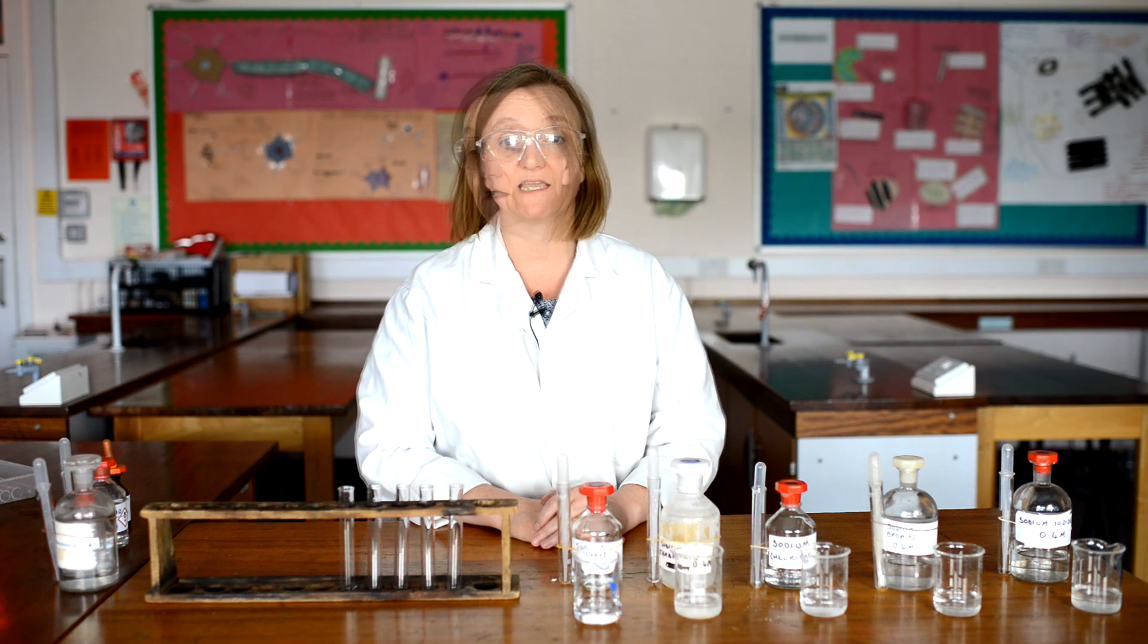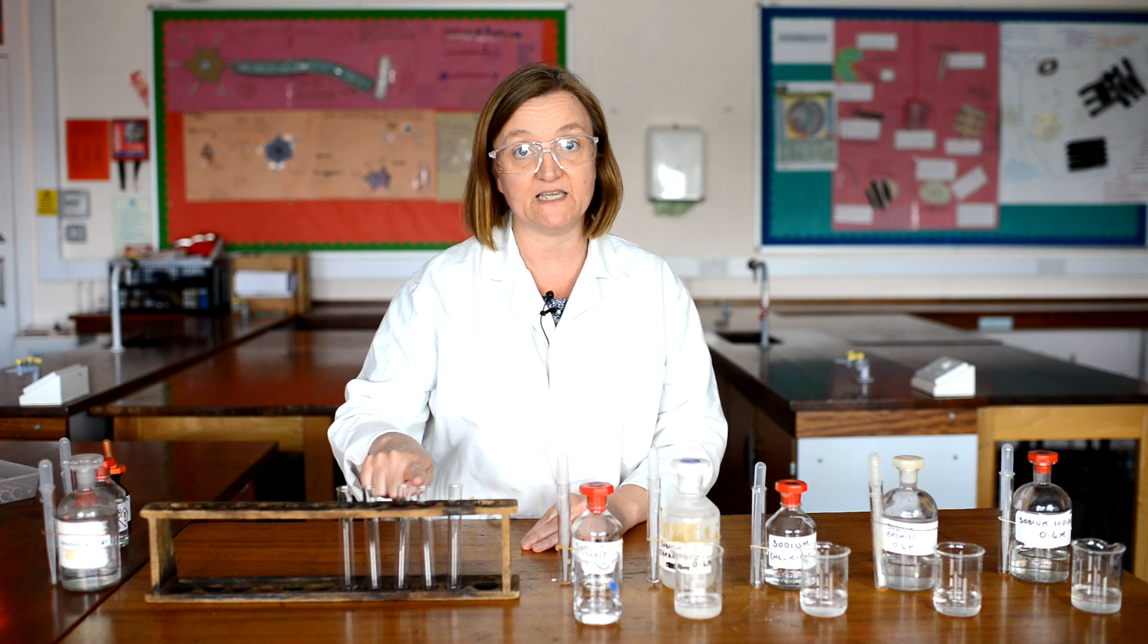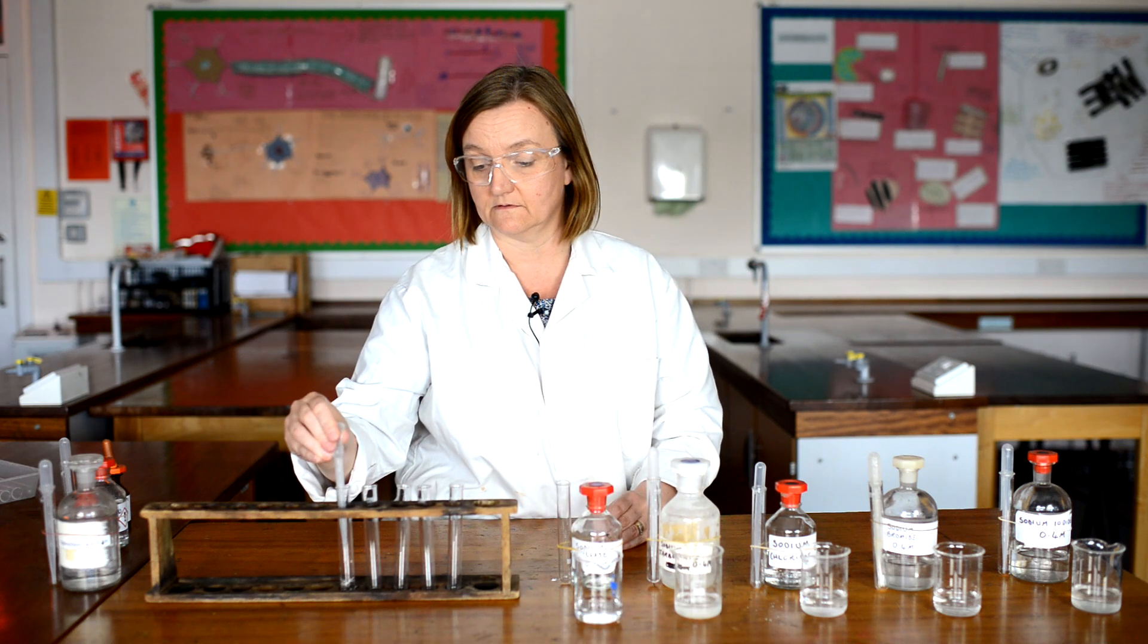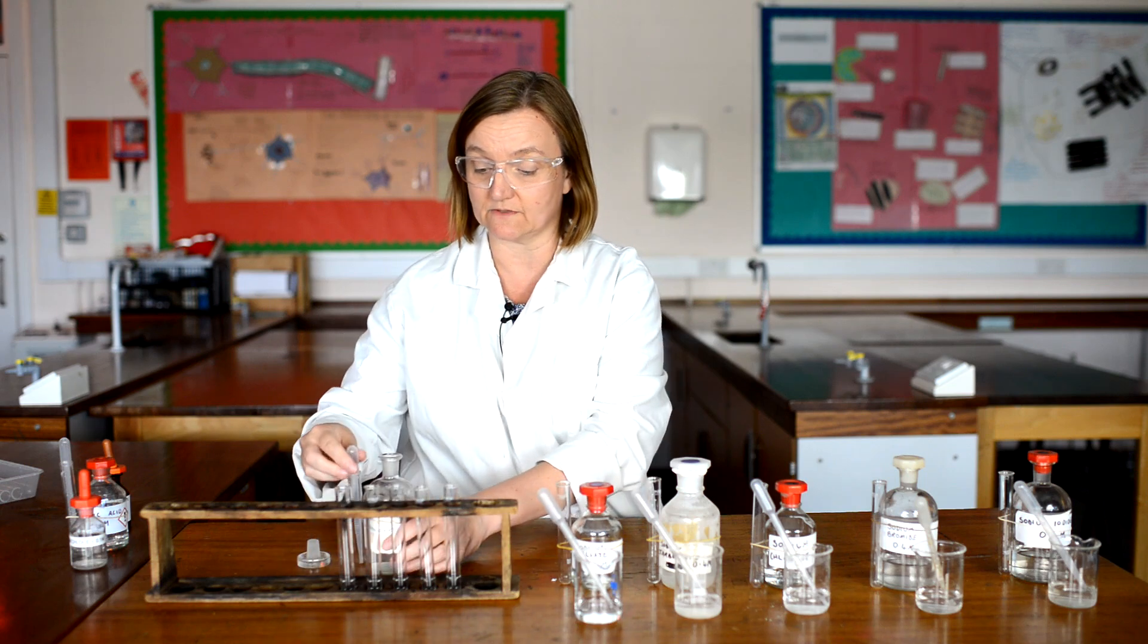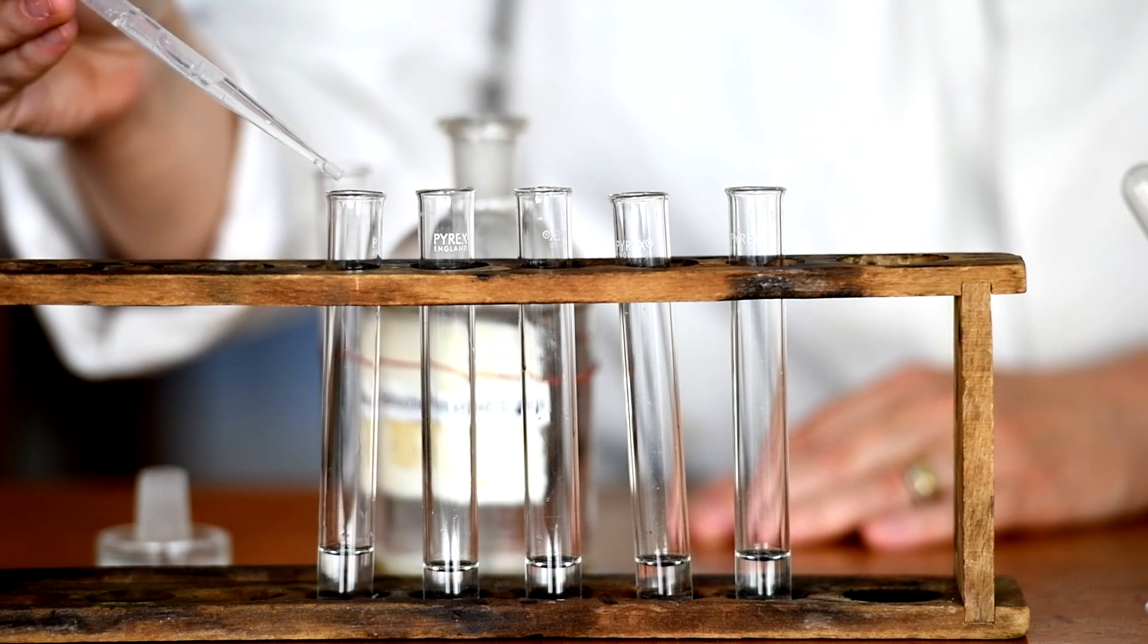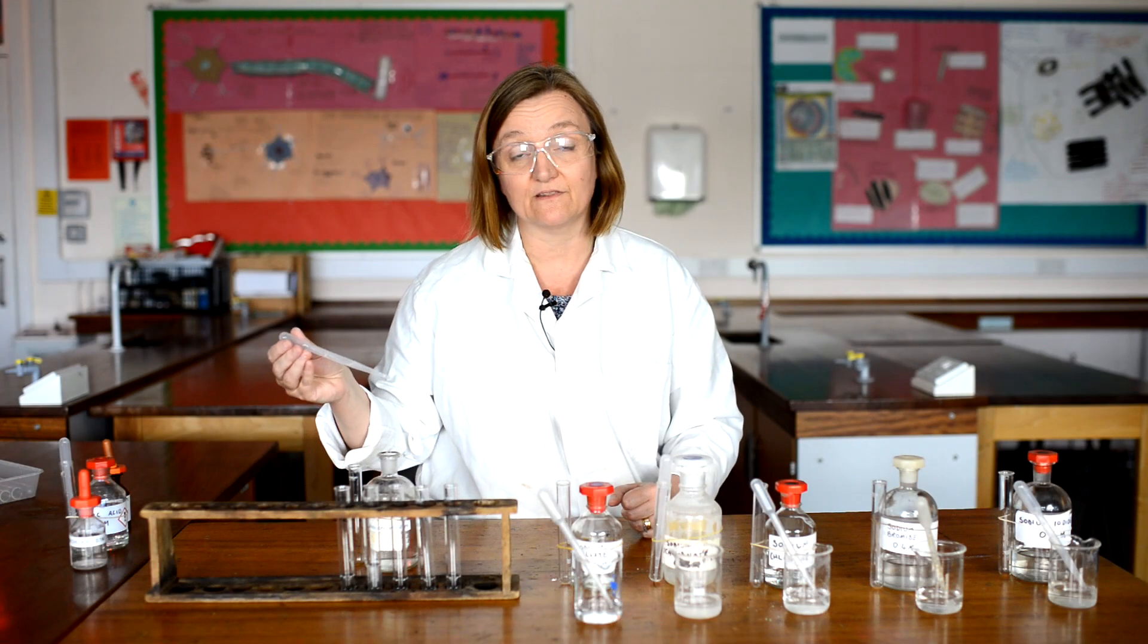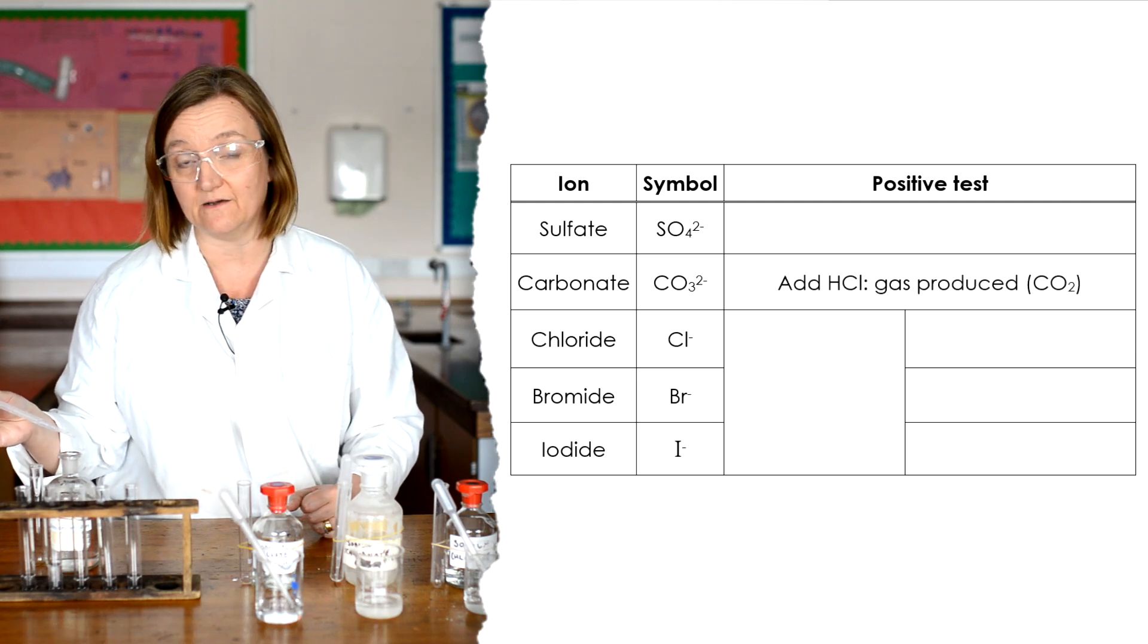So we're going to start by testing with hydrochloric acid. So I've got my five test tubes here, and I'm going to put a little bit of each of the solutions in the five test tubes, in this same order. So starting with the sulphate. So I'm going to start by adding some hydrochloric acid to each of these solutions. So let's watch carefully to see what happens. So first of all, hydrochloric acid in sodium sulphate. Not a lot. So now hydrochloric acid in sodium carbonate. Oh, do you see that fizzing? Now that is carbon dioxide gas being produced. So hydrochloric acid can be used as a test for carbonate ions in solution.